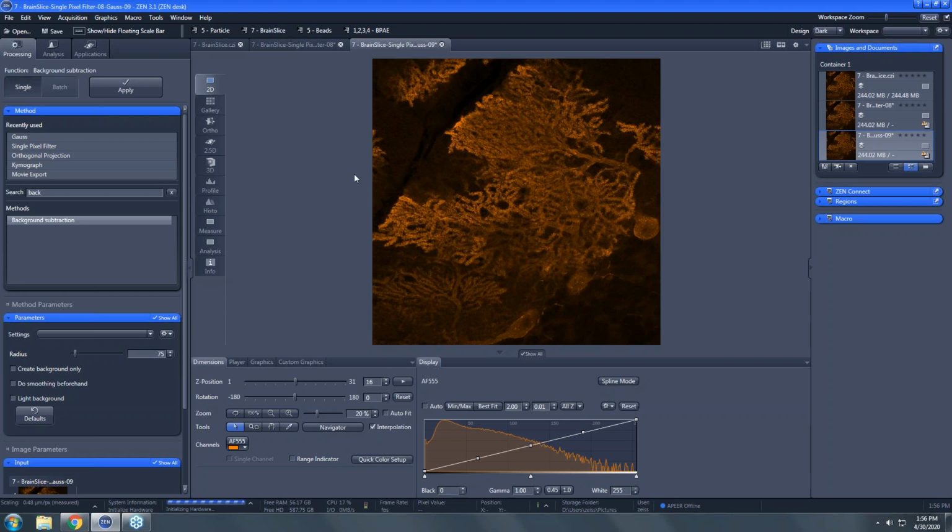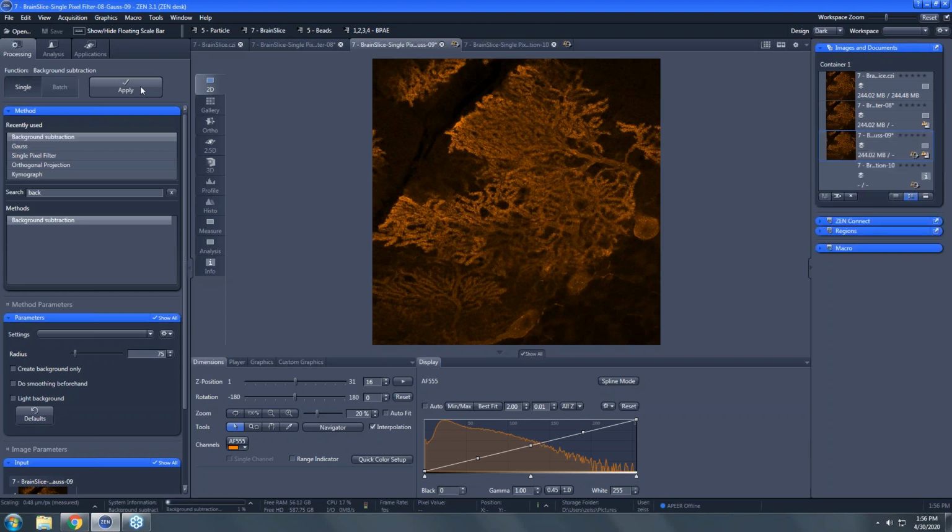If we run into high contrast, then we say, oh, that's an object. So let's not do the object. Let's not do the contrasted area. So I think we figured that 75 was a good value for this image, and that's really a bit of trial and error, but it's a radius in pixels of objects in your image. So if you can zoom into objects of interest and figure out how many pixels wide they are, that's a good starting point. And then I would just go bigger and smaller from there. Okay, let's apply this. That will take a little bit.